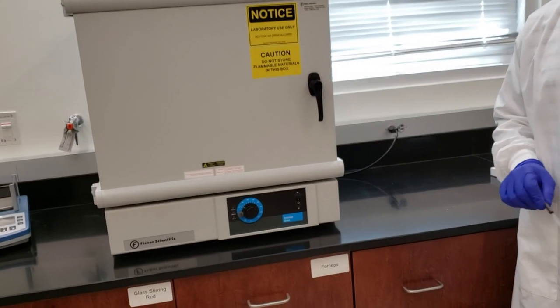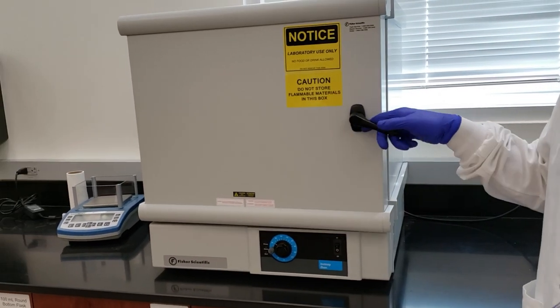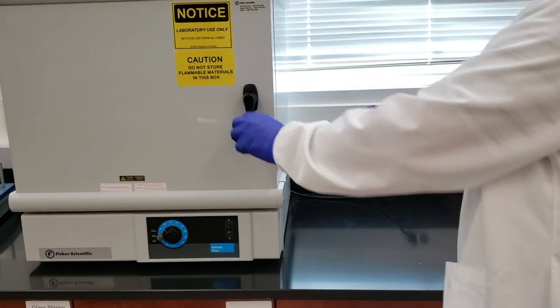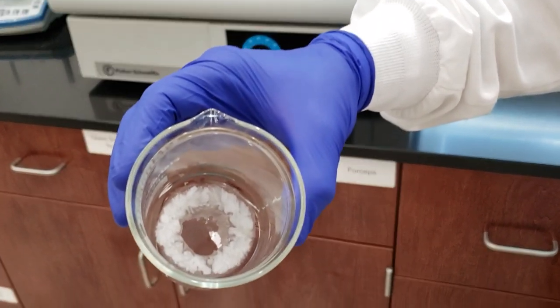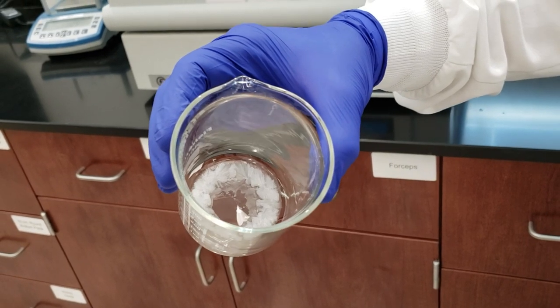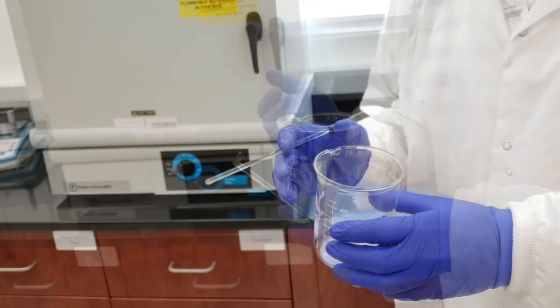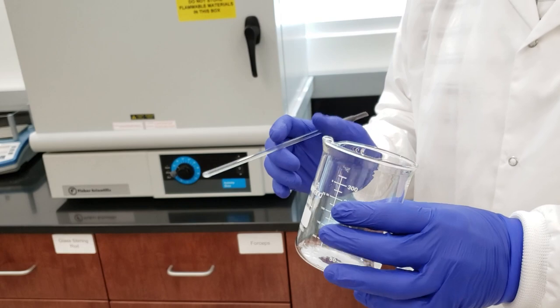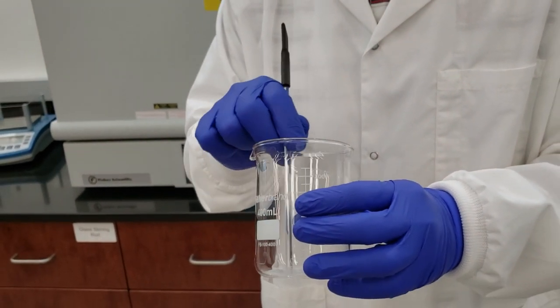So we've let our product dry in the beaker inside of our drying oven for about 10 minutes. We're going to go ahead and get it out. And we've got some nice crystals that have formed. I'll tilt it up like that so we can see. We're going to break these crystals up, make sure everything's dry. We'll do a waft test. I don't smell any ethyl acetate, so we're pretty sure that we removed all of our solvent. We'll weigh this and find out how much product we actually ended up collecting.